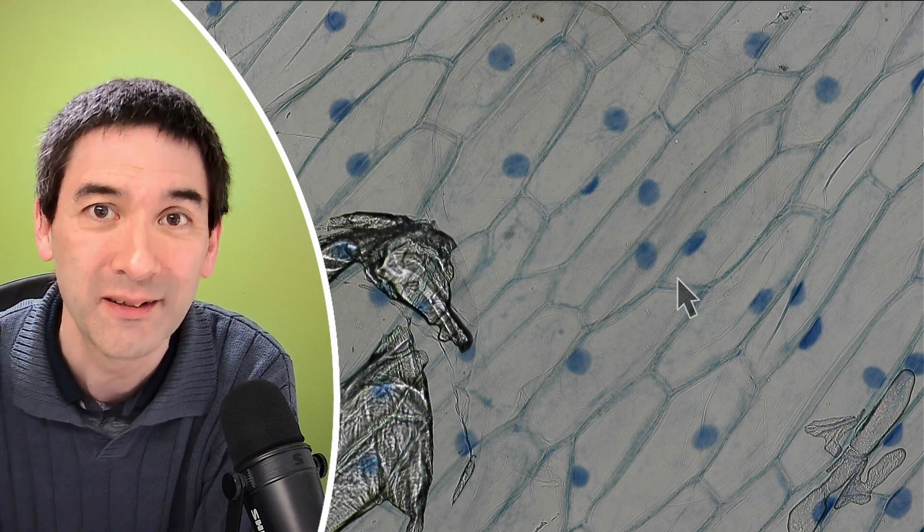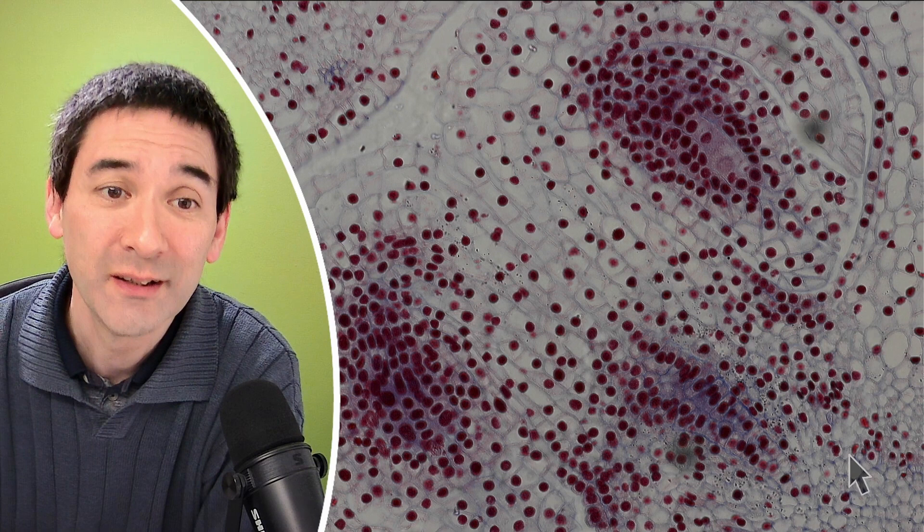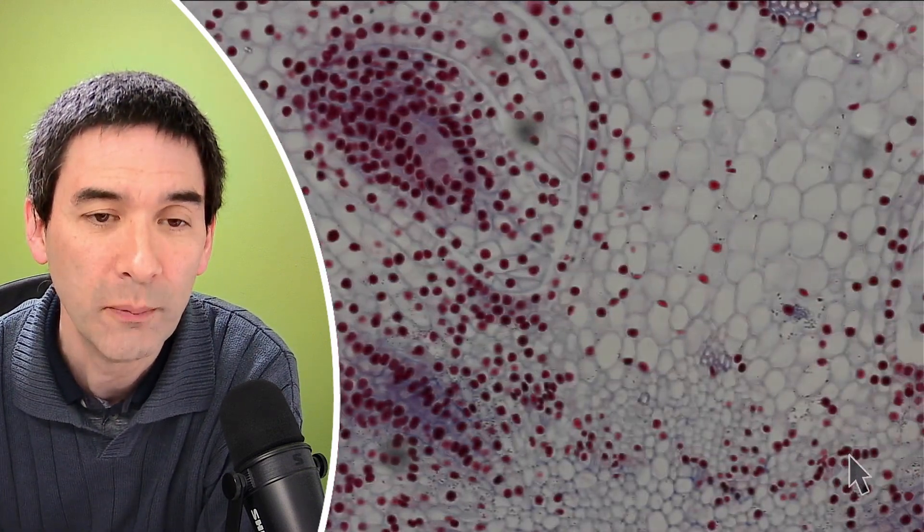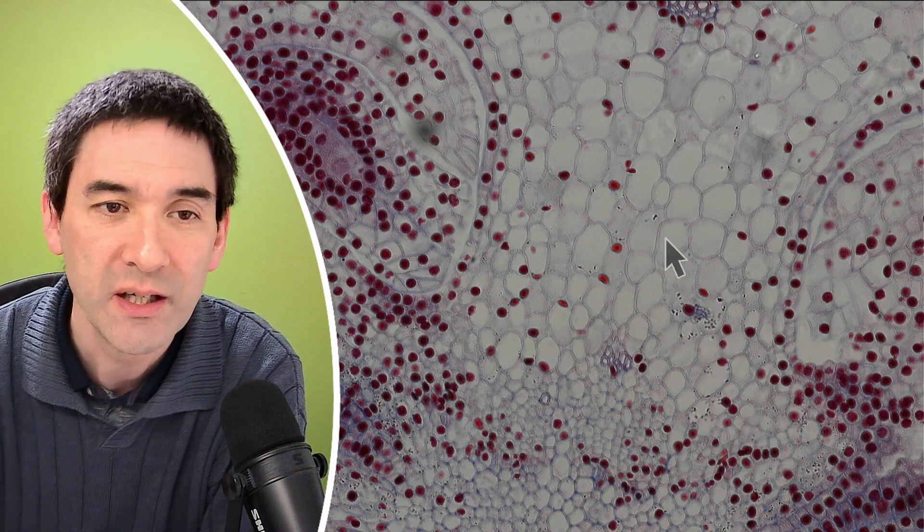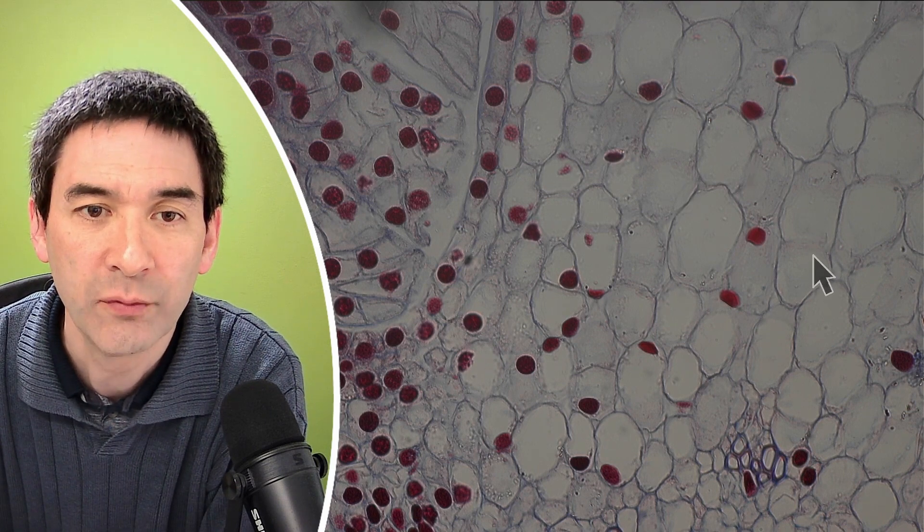However, there are also plant cells that do not seem to have a nucleus. And I would like to show that to you. And then I would like to explain to you why this is the case, because it's actually not quite as straightforward. So let's have a look at a different plant cross-section. So this here is now the cross-section of the ovary of a lily. The lily is a flower, and you can see that over here, those little dots that you see here, these are the nuclei. They use a different substance for staining it, so it's red and not blue. But if you actually look a little bit here on the periphery, you're actually going to see that a lot of cells don't have a nucleus here. So why is that? But let's zoom in a little bit more. Here we see it quite nicely. Your nucleus here and all of those red structures are nuclei. But many cells over here which don't have one, that's kind of strange. You might think, actually, I have to tell you this is a preparation artifact, as I like to call it.